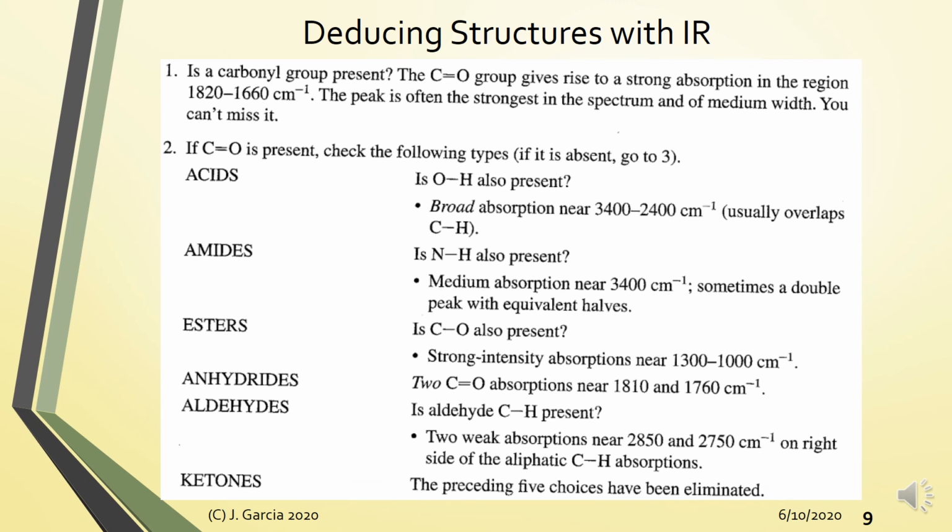Okay, so a good way to interpret your IR is by doing deductive reasoning. Okay, sa IR spectroscopy kasi, the absence of a peak corresponds to the absence of a particular functional group. So it's easier to look for missing peaks rather than interpreting the peaks present. No, mas simple yan. Okay, so how do we do deductive reasoning, no, in IR interpretation?